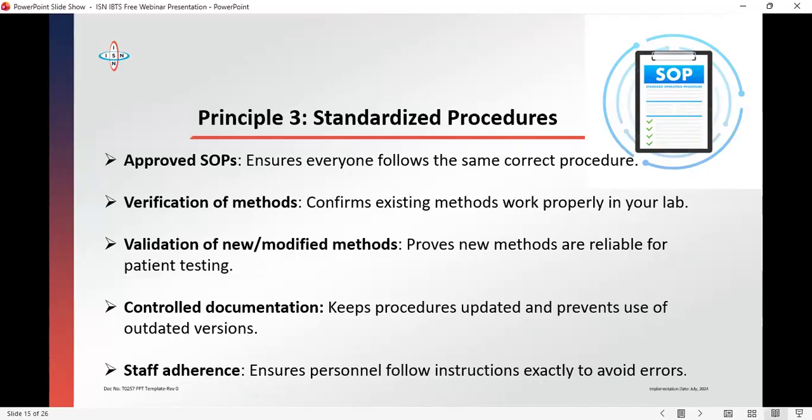Verification method. Do we have a protocol for verifying our instruments, or is it just plug and play? You know how you will buy a washing machine or a TV and they will say there's a warranty period. It is in the using of the instrument that you will find out whether there is a factory error. That is why they issue those warranties.